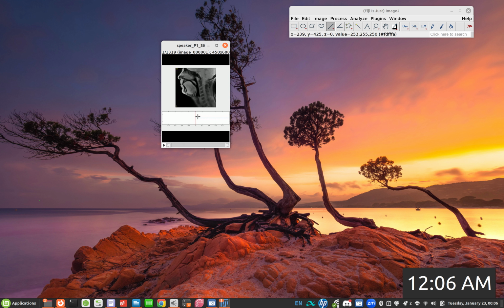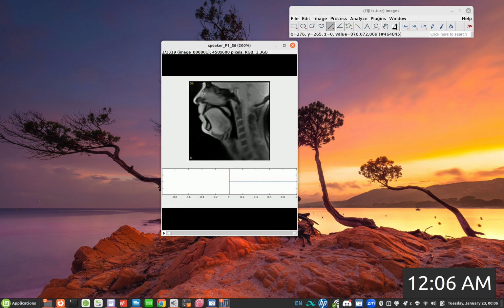Now this looks a little tinier than I was expecting, the view. So the view can be made more comfortable so that we can see the landmarks more easily. What I'm doing is pressing and holding my Control and then revolving the roller on my mouse like this. So okay, this view looks perfect for me.